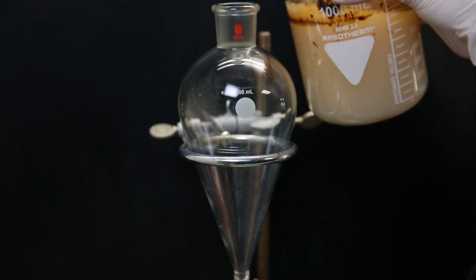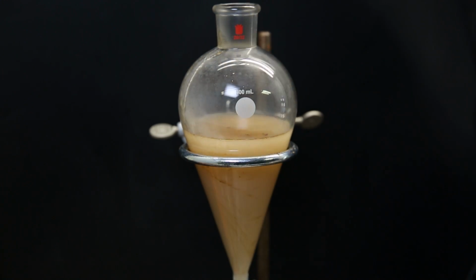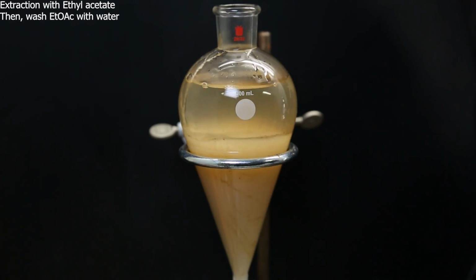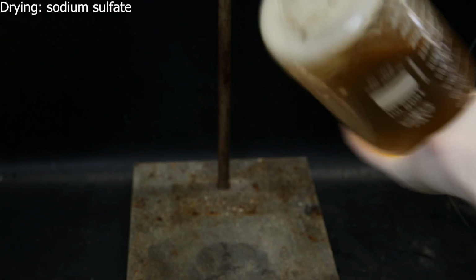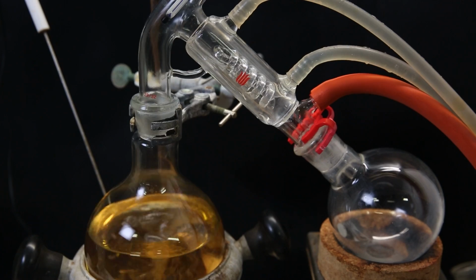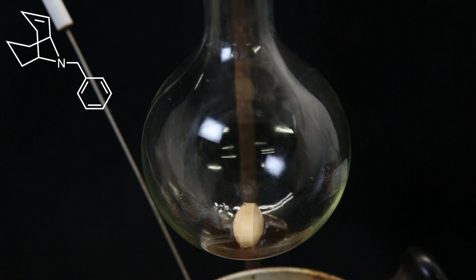I then move all of the mixture to a separatory funnel in portions and extract it with about 800 ml of ethyl acetate in total. The ethyl acetate is also washed once with water, and then I combined all the ethyl acetate extracts in a large bottle. I dry it with a bunch of sodium sulfate. I then filter it all through some cotton into a 1 liter flask. I then distill over all of the ethyl acetate with short path vacuum distillation, and afterward I am left with a red oil, which should be the dehydrated product.